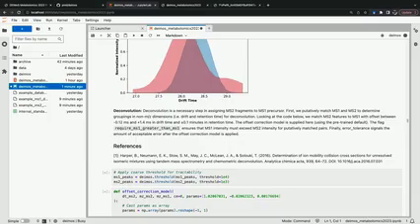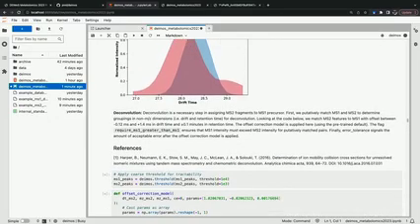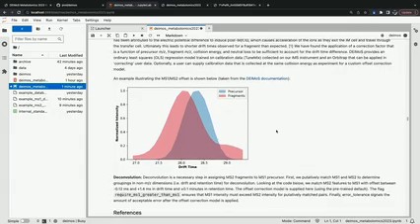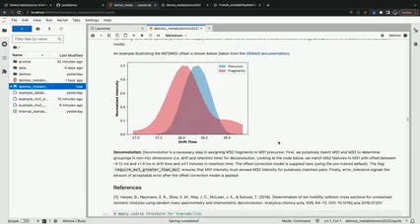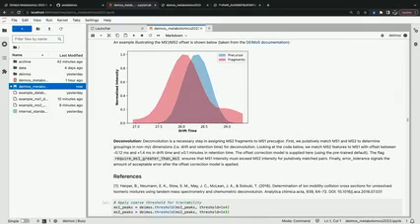Oh, yeah. So I ran all of them through decon, so if you wanted to talk about it. Yeah, so since there's an offset between the drift times for the precursor and fragments, you can use DEIMoS to apply that offset, and so you can better associate the MSMS fragments with the precursor.